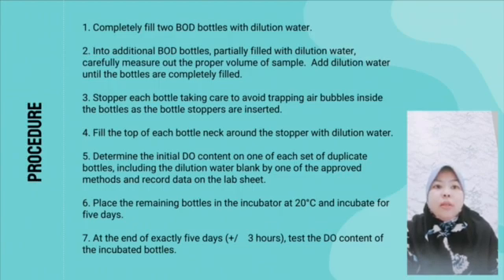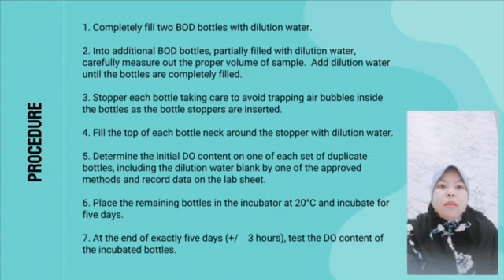Add dilution water until the bottles are completely filled. Third, stopper each bottle, taking care to avoid trapping air bubbles inside the bottles. Fourth, fill the top of each bottleneck around the stopper with dilution water.